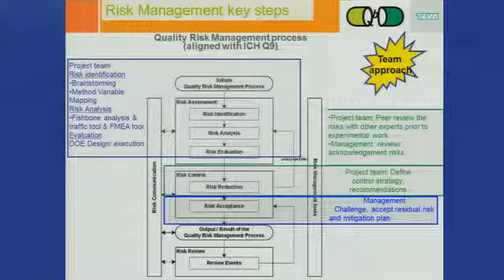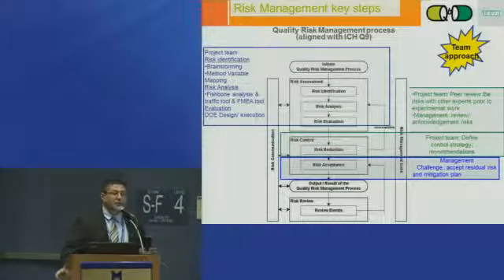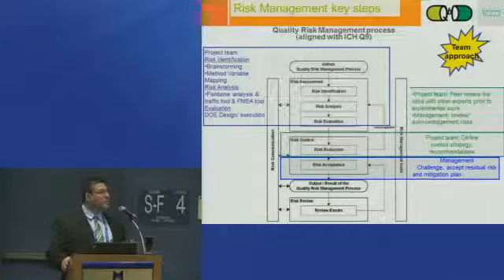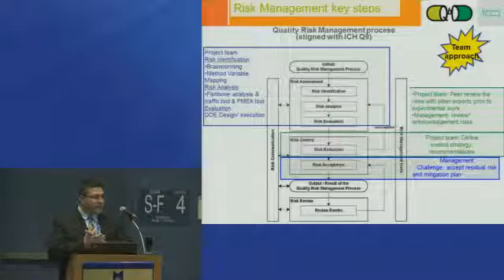the portfolio or pipeline. You then do some method variable mapping. I want to use the word variable. We're moving away from the terms factor and parameter. So the word we tend to use now is variable. So you'll start to see that a lot more often in some publications and presentations, and I believe the USP might also be adopting this verbiage in the future as well.